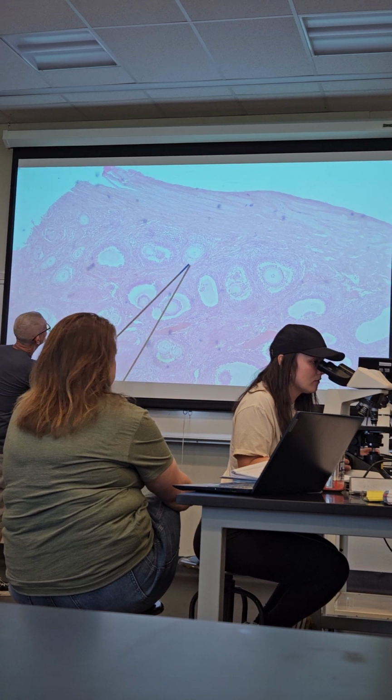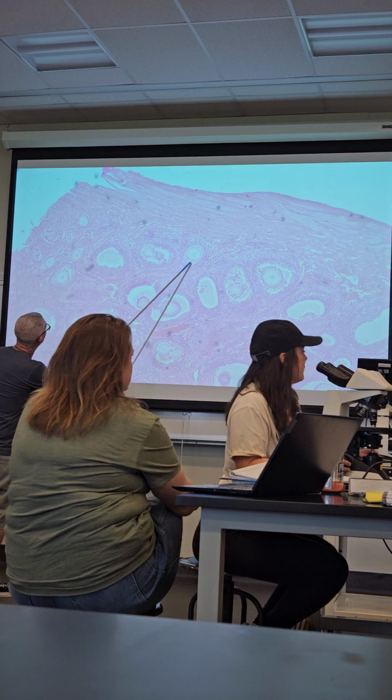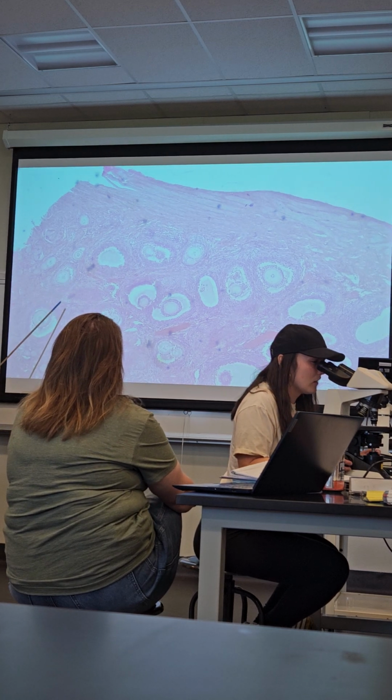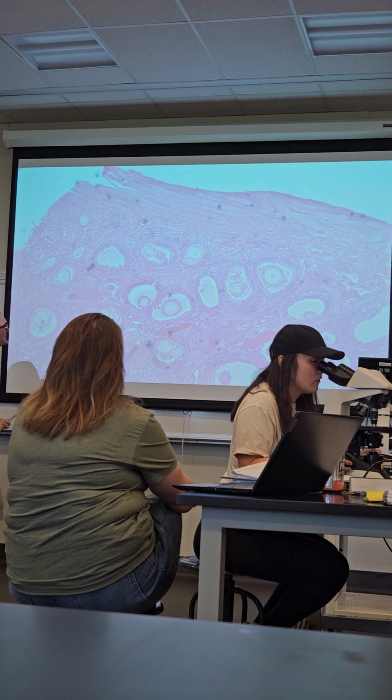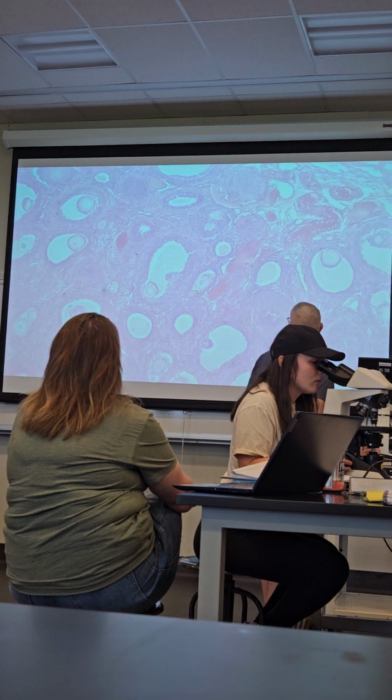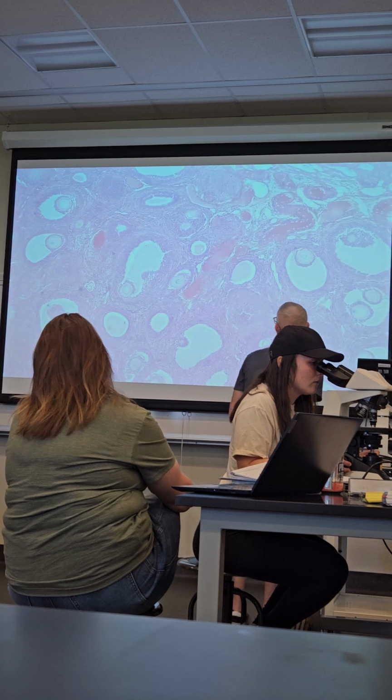This is actually what would be a secondary too, with that little break right there. That's a secondary. That's a secondary. Almost all of these in the field of view are secondary. It's a good slide for secondaries. What about this guy?